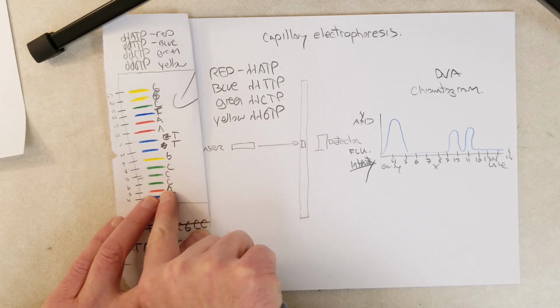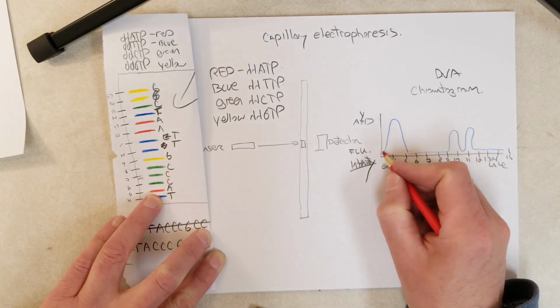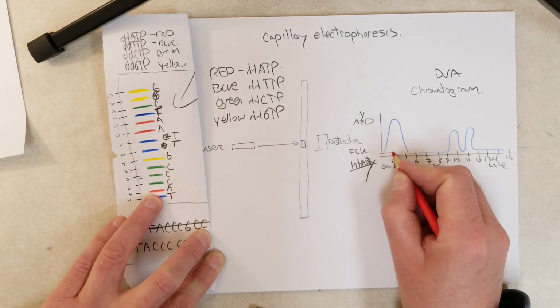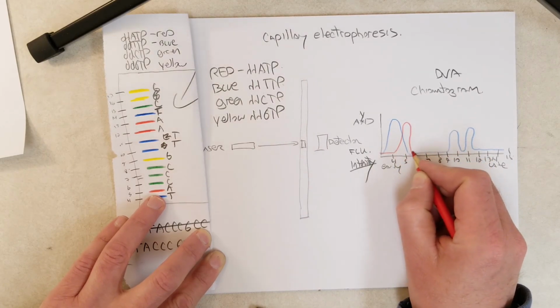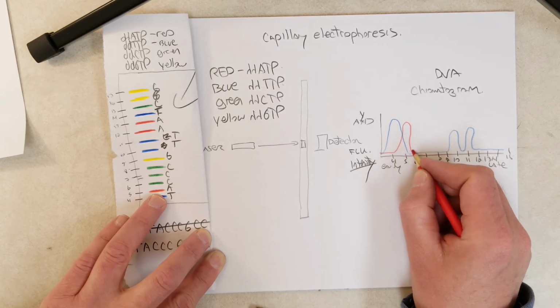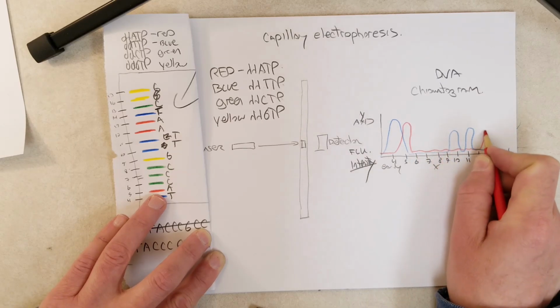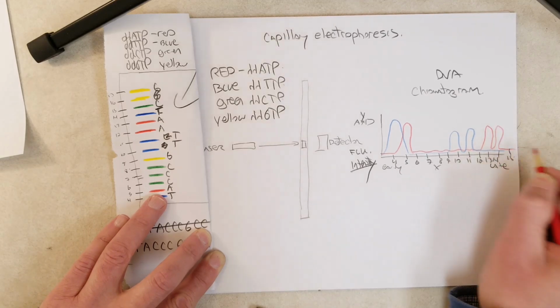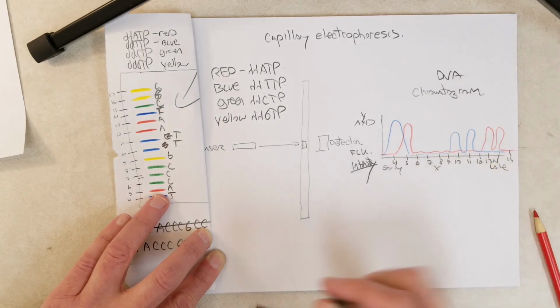And over here, we see that there should have been a 5 nucleotide long sequence that ends with A, which is red. So we should expect to see a red blip at about this position right here. So the red intensity was really high at about this time point. And then we're not going to see another one until 13. So the red signal is going to be really low until 12 and 13. So it's going to look something like that. I'm a little off scale here, but I think you get the point.